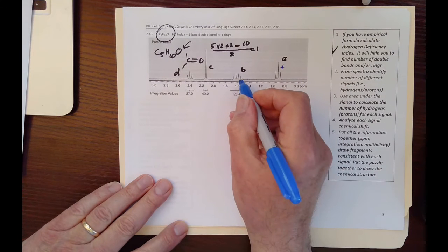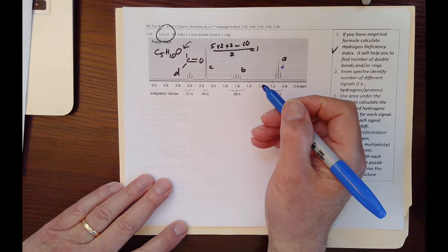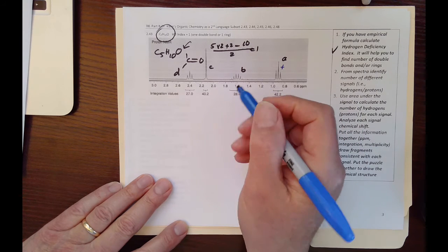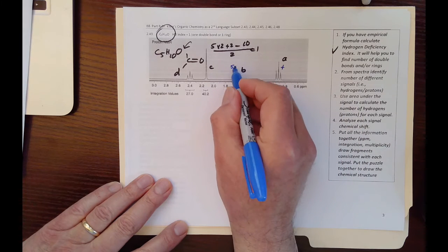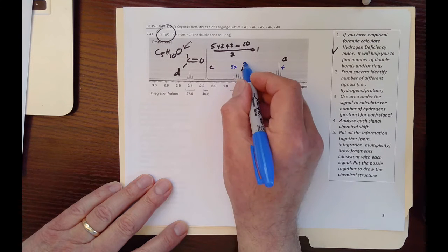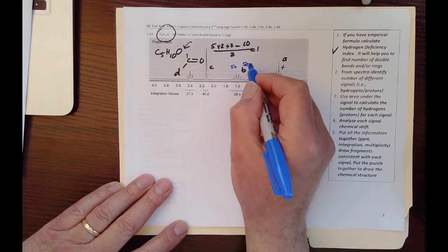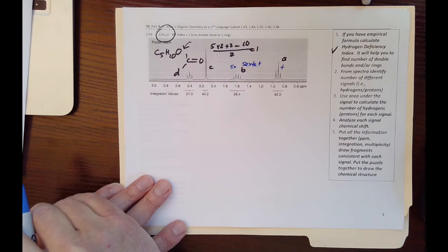This B is hard to read, but the little peaks here, there are 6 of them. So this is a sextet. I should have put an E there. SEXTET. 6 of them.